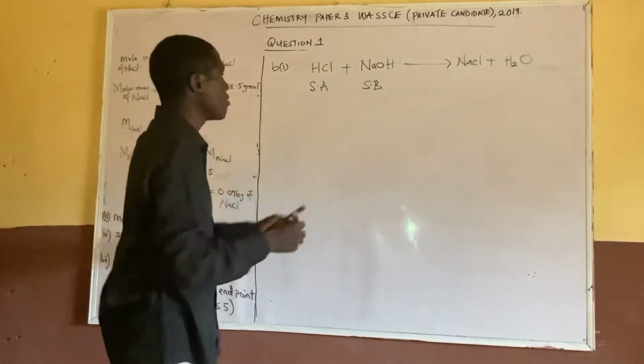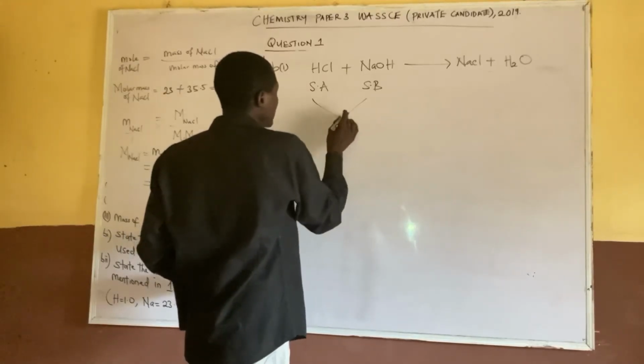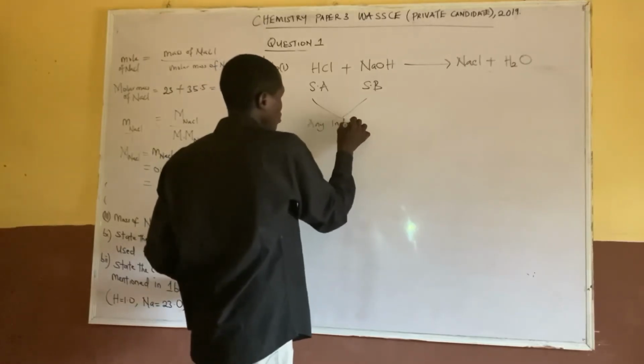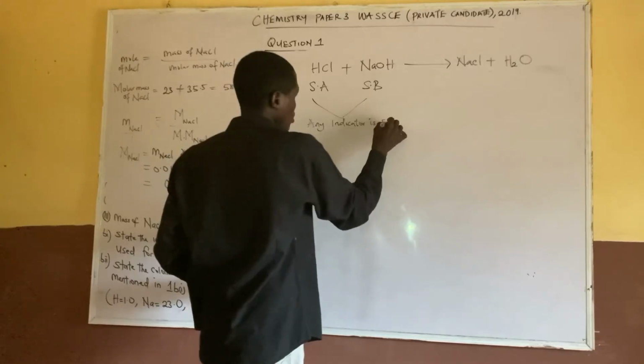So when you're having a reaction between a strong acid and a strong base, any indicator is suitable.